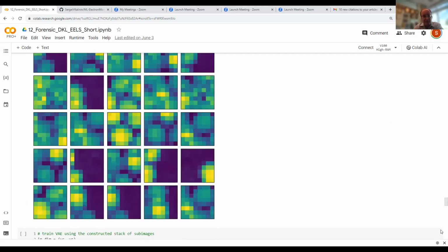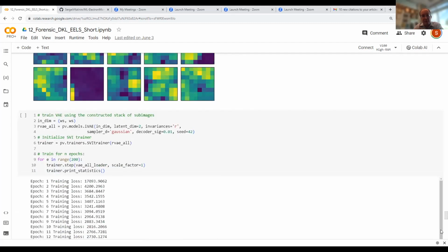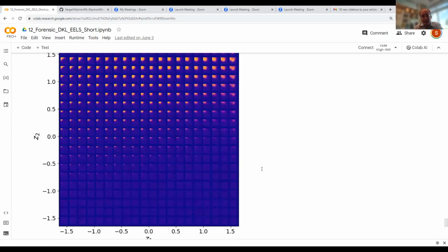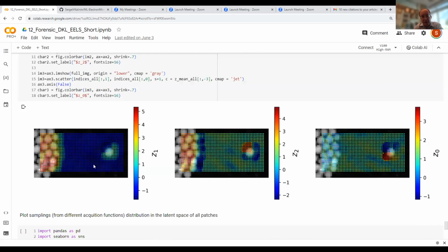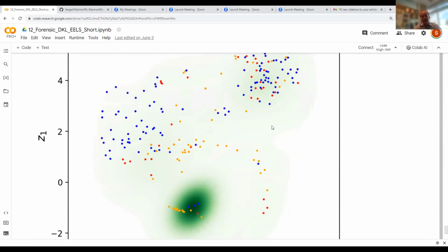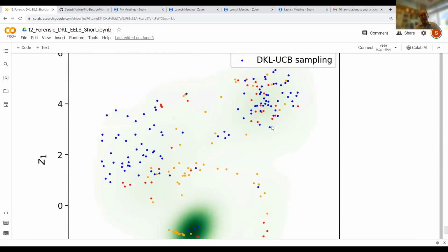So this is where we're getting to the global one. The global one is available from the beginning of the experiment, and we can create the latent representation. We can create the latent images as before, and we can basically create the trajectory of the experiment in the latent space of the global system. And this is again something that we can visualize during the active experiment.